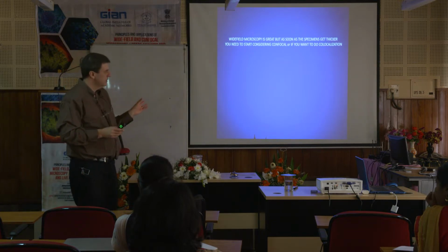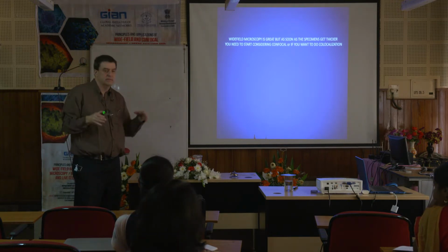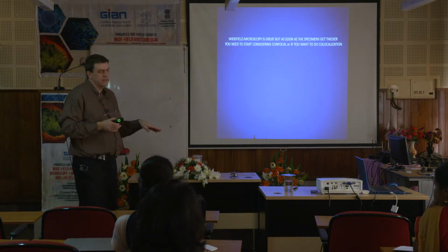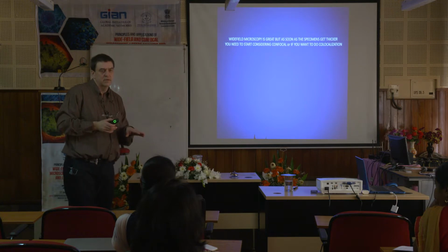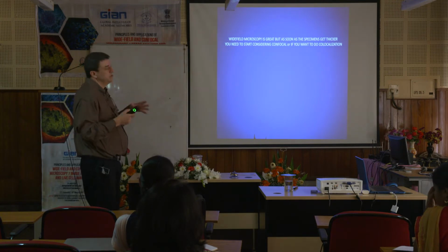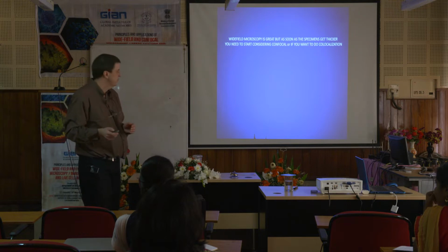Whereas a confocal, when we talk about it a little bit more, tends to get rid of that scattering to some extent. So it'll make a sharper, cleaner image. So thin stuff, I have no problem working on the wide field. Cells especially, because cells obviously are very thin, just a few microns thick. But if you're going to do tissue, you're going to go deep. You're almost for sure going to need some type of confocal.